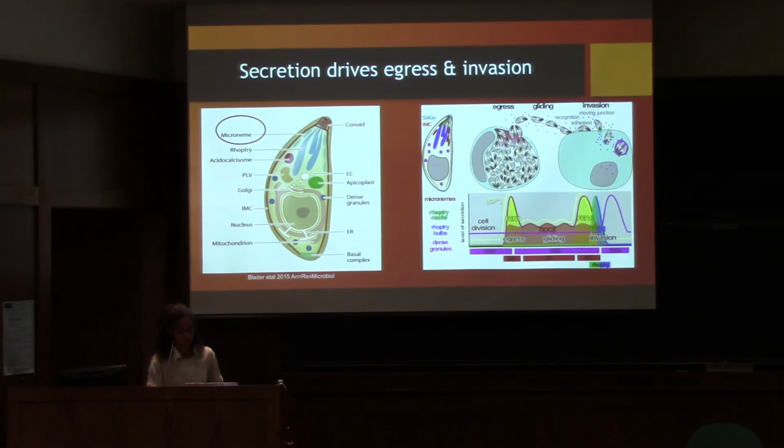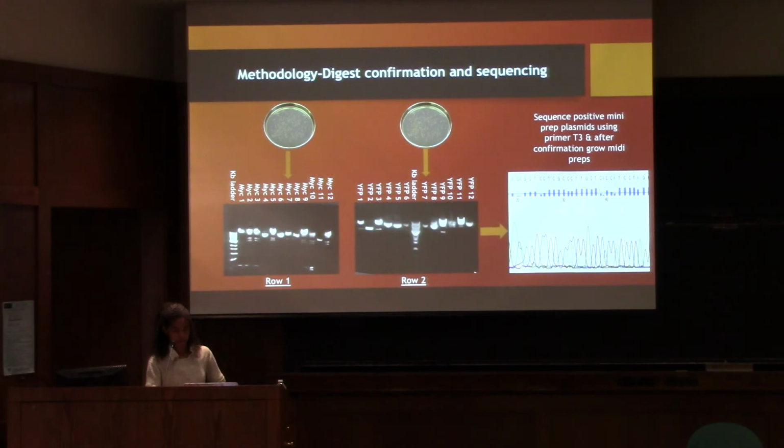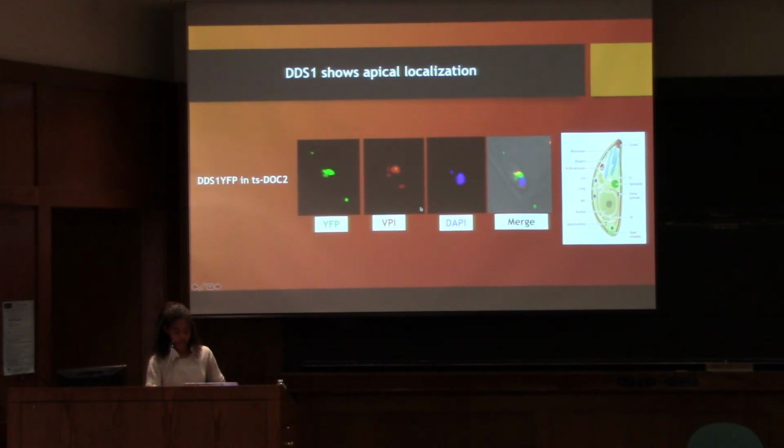Can you go to the imaging of the cell with the labels? This one, with the microscope. Okay. What scale is this? Like how big is the image or the cell? It's not big at all. I just cropped it to make it look closer than it actually is. But when you're looking at it in the microscope, it's not big. Do you know how many microns or micrometers? I'm not sure, but if I were to answer, I would say 6, 7.